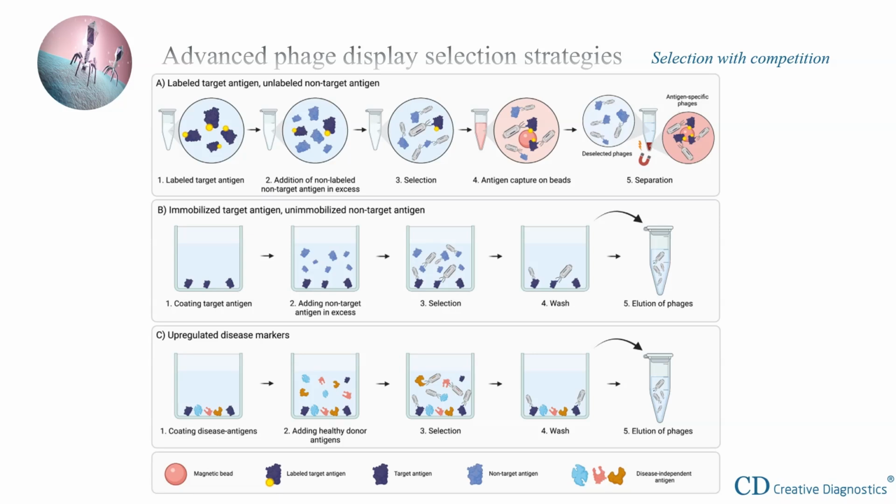Since antibody-antigen binding is a dynamic equilibrium, not all antibodies are bound to the antigen at any given time. So during deselection, some antibodies that recognize the related antigen might not get bound and removed, and end up carrying over to the next selection round, where they might bind the target antigen. To get around this, besides or along with deselection, you can also add competing antigens during the selection process. This forces antibodies to bind only the target antigen, improving the selection outcome.